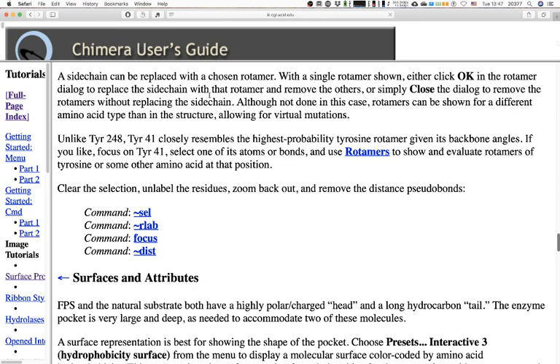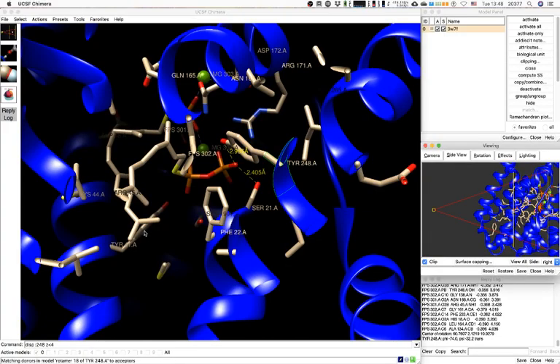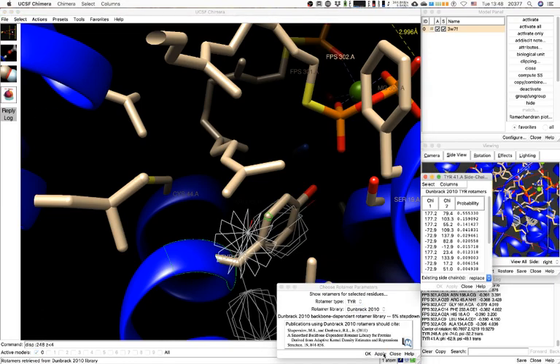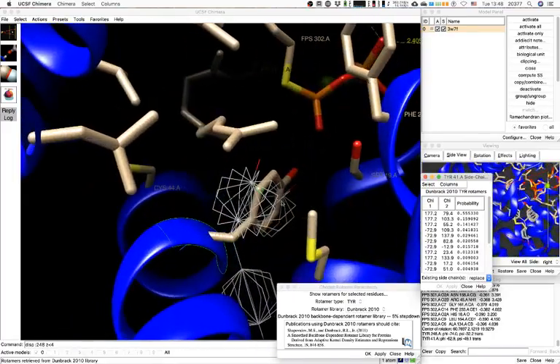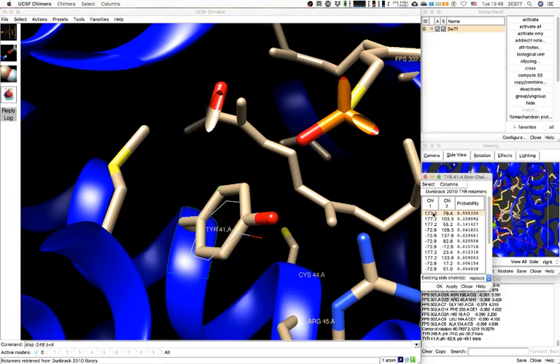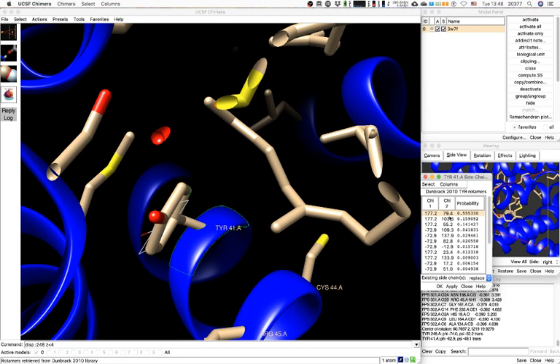Unlike tyrosine 248, tyrosine 41 closely resembles the highest probability tyrosine rotamer given its backbone angles. Focus on tyrosine 41 and select one of its bonds. Use Rotamers to show and evaluate rotamers of tyrosine or some other amino acid at that position. There's a series here that mostly have the same orientation. The highest probability rotamer is so much more probable that you would probably use that one.